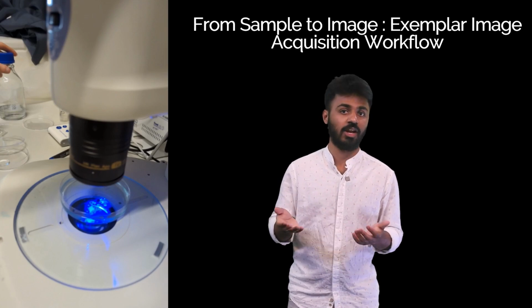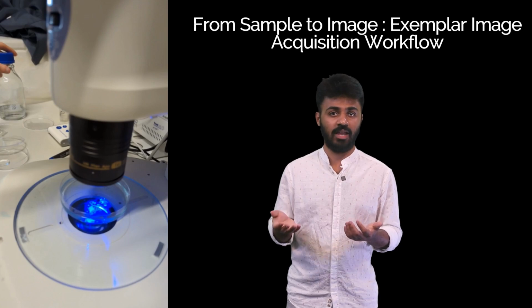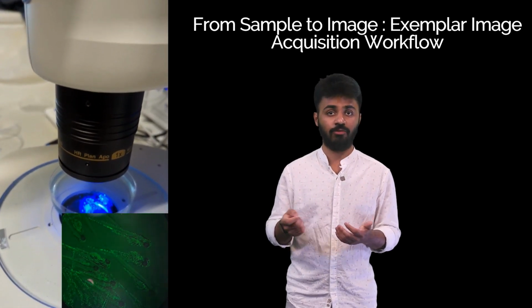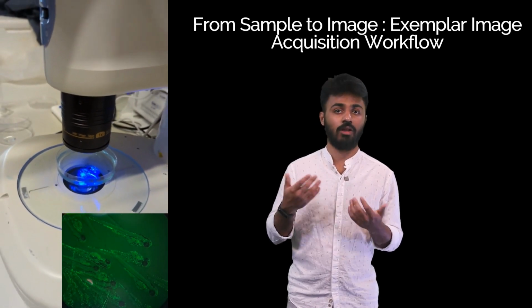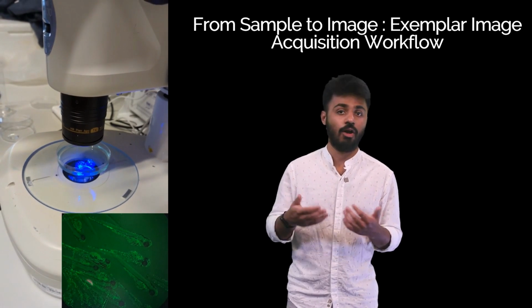We begin by screening the embryos for a positive GFP signal and select those that exhibit the desired activity for further imaging. After screening, the selected embryos need to be prepared for live imaging by choosing an appropriate mounting medium that will provide the necessary support and stability to the sample while minimizing any potential stress or damage.